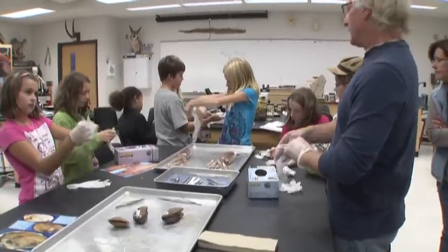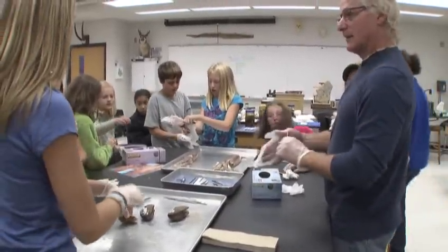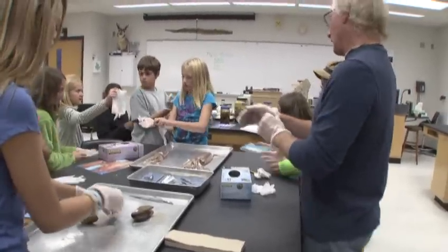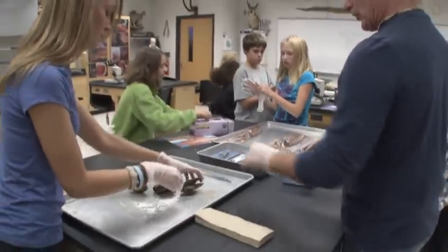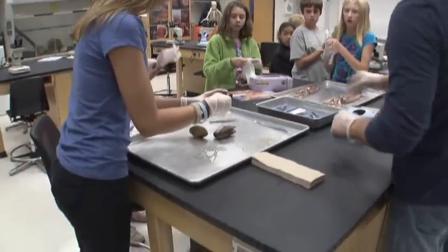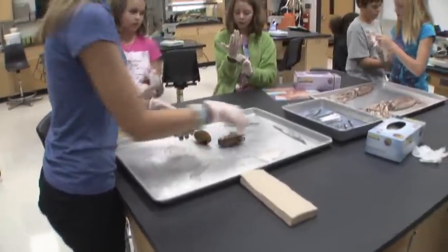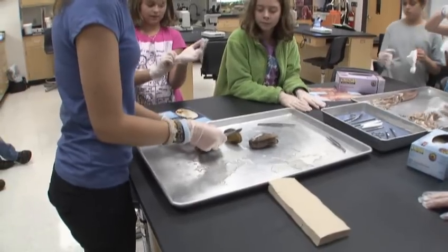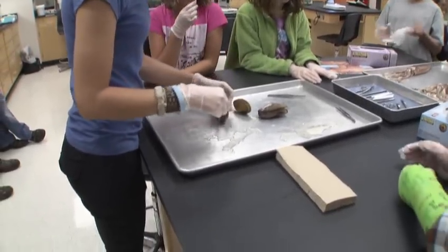Okay, now I need maybe 3 or 4 people over here. Dr. Matt, are those 2 separate squids? Yes, 2 separate. Well, they're the same species. Right. So let's start over here with Courtney. She's going to take apart one of them. We're going to point out things. So somebody get over here so everyone can see. We're cutting stuff with a scalpel. And you guys will be able to feel these.